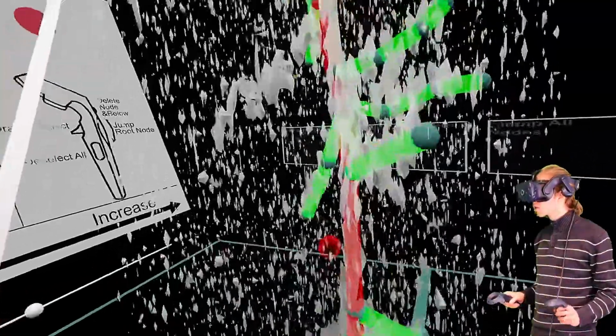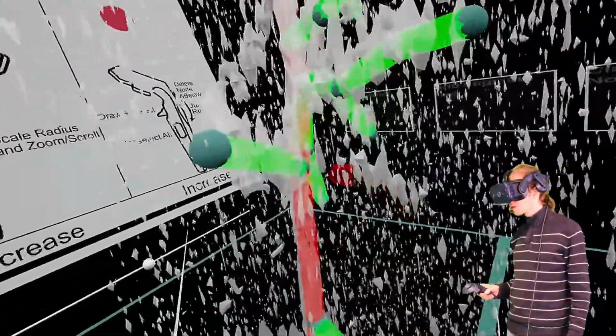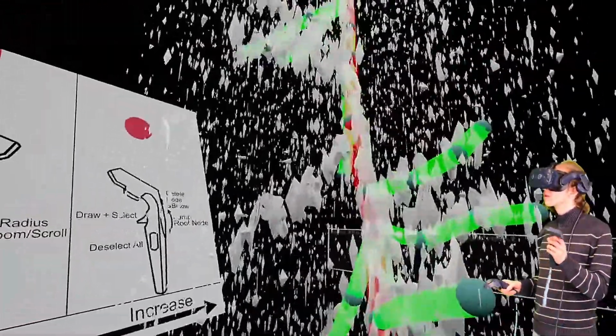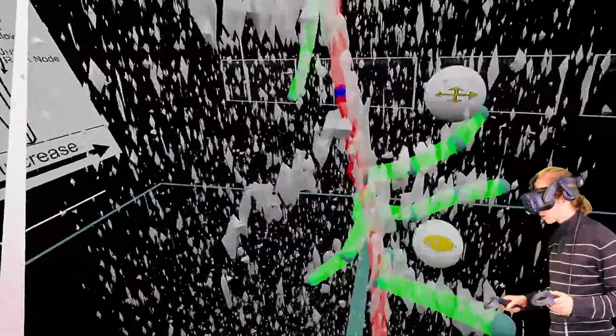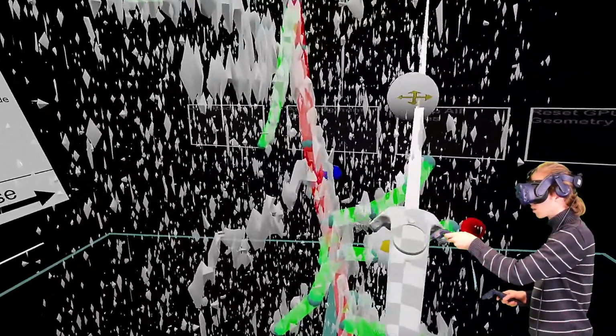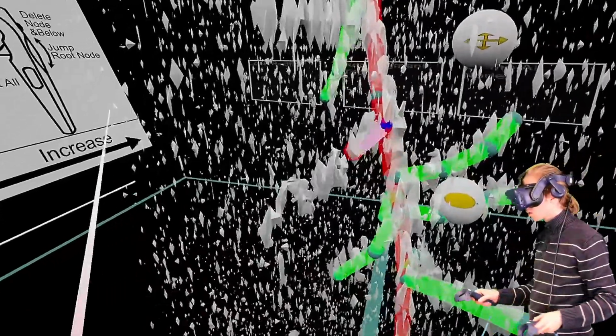If something goes wrong, there are additional functionalities, such as undo, which restores the version before the last action was taken. If the data is particularly noisy, this is where virtual reality tracing really shines, as it is easier to navigate in 3D space if users have access to a 3D visualization of the scene. In our study, this was shown by a stark increase in the F1 score in the water noise condition.